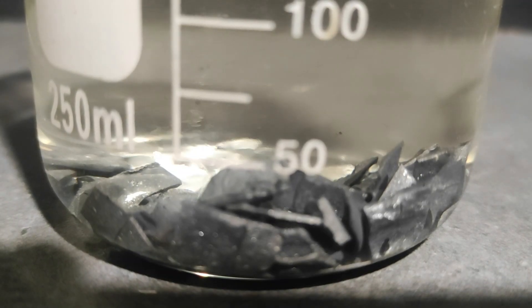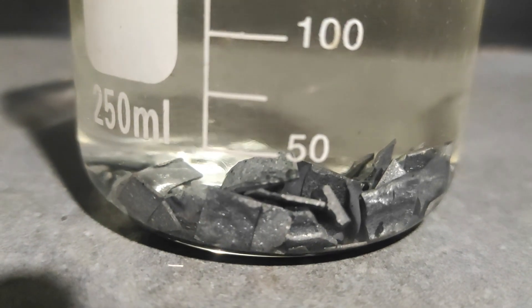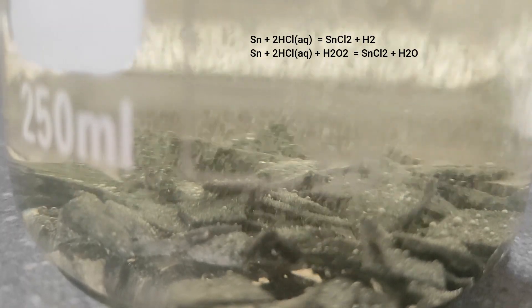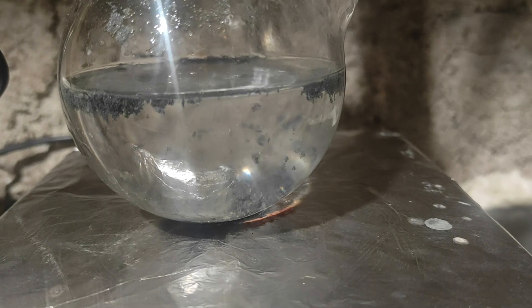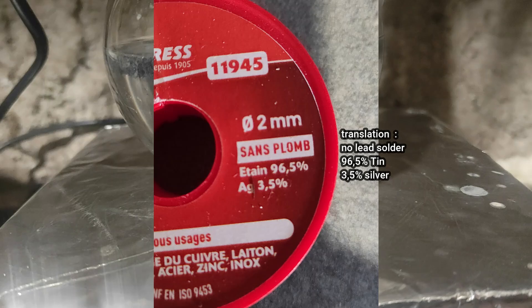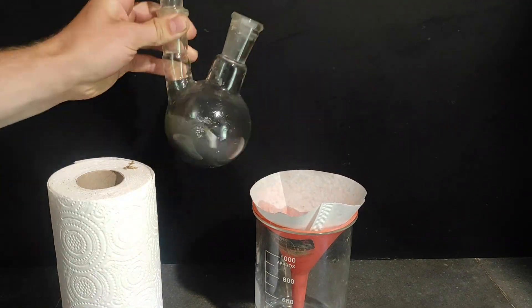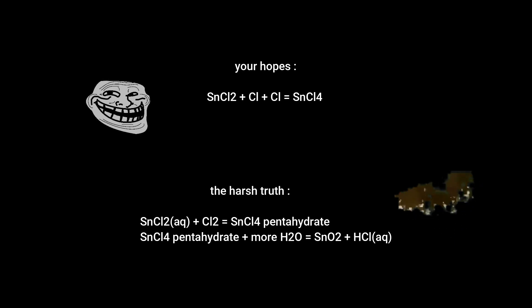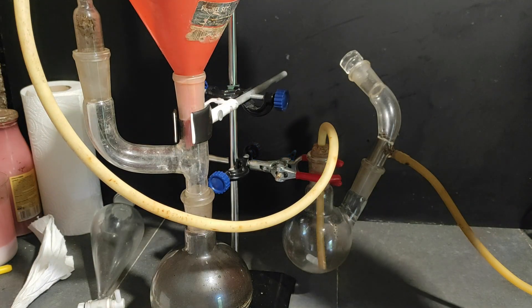After some time the metal tarnishes and finally evolves hydrogen gas under some heat. The hydrochloric acid is reacting with the help of hydrogen peroxide to form tin dichloride and hydrogen gas. There are some undissolved bits of metal, which is actually silver because the solder I used supposedly contains 3.5% of it — I recovered that later as a gram of silver chloride. The next step is to add 2 more chlorine atoms to the tin dichloride we made. However, if we directly react the tin dichloride with chlorine gas, the tin tetrachloride formed will be hydrolyzed by water to form tin dioxide, which we don't want. The trick is to first saturate the solution with hydrogen chloride gas to favor the presence of tin tetrachloride hydrate.